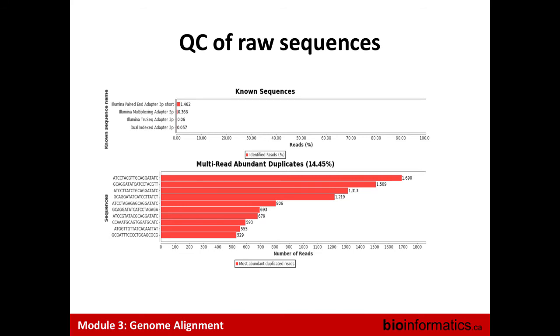As your reads have been randomly placed from your DNA fragments, when you do high coverage, you have several copies of the same region, but the reads are not the same initial DNA fragments that have been cut and put in the libraries. You have several copies of your DNA, and you cut it in pieces. So if you have duplication, you will have more pieces of the same region, right? But you don't want one piece to generate several reads.